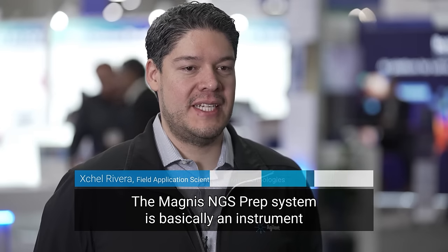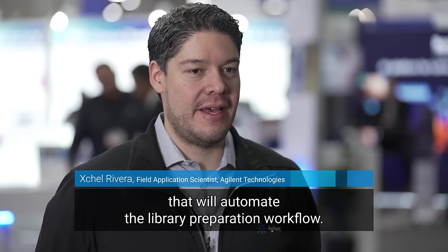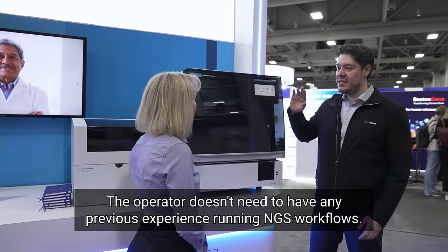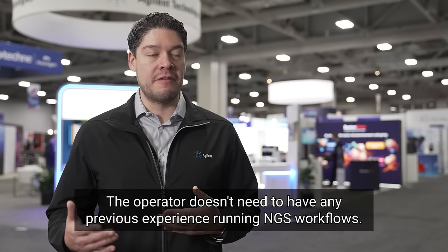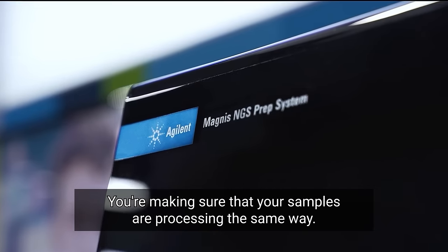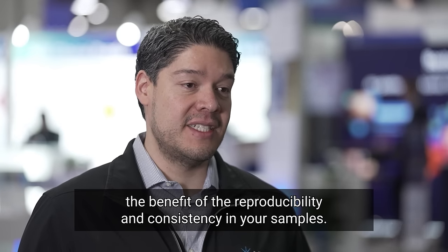The Magnus NGS prep system is an instrument that automates the library preparation workflow. The operator doesn't need to have any previous experience running NGS workflows. You are making sure that your samples are processed in the same way, and that, of course, will give you the benefit of reproducibility and consistency in your samples.